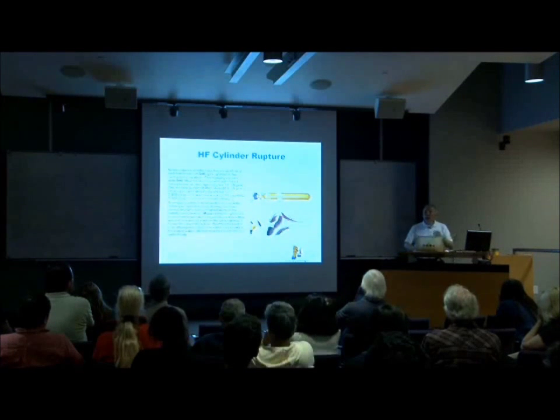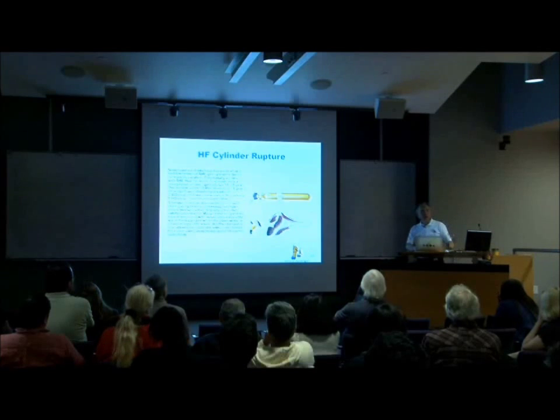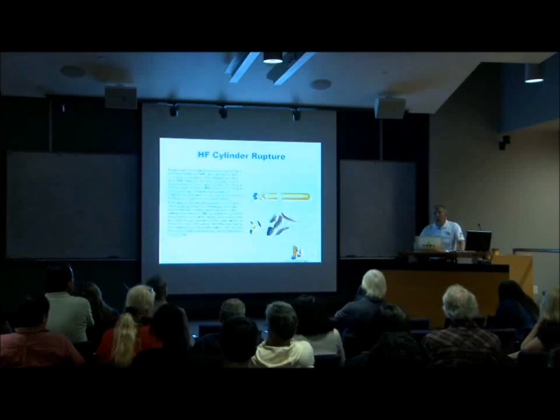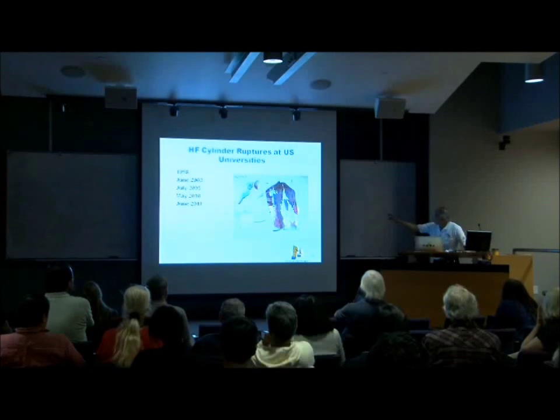Now, here on campus, you have a policy, corrosive gas, maximum of 6 months. Okay? I would recommend that you take a look at the policies that you have in place, because you have a lot of good policies that will guide you to safe practices.